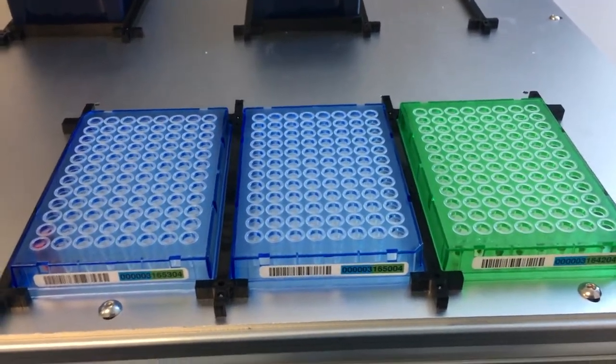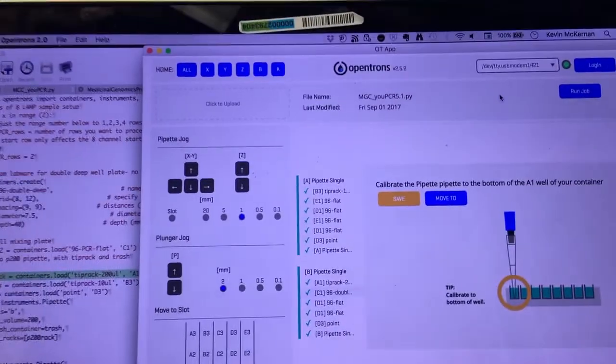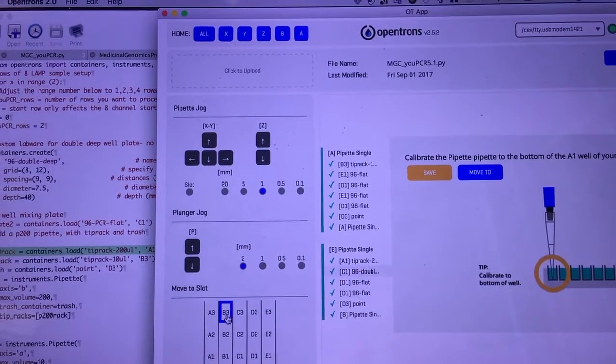The DNA is in the green plate. The reagents that have been all pre-mixed are in those wells, and they're going to get distributed to these eight wells on this little platform. It's only 4K. A little simple, good user interface here for joysticking this machine around without any complications.